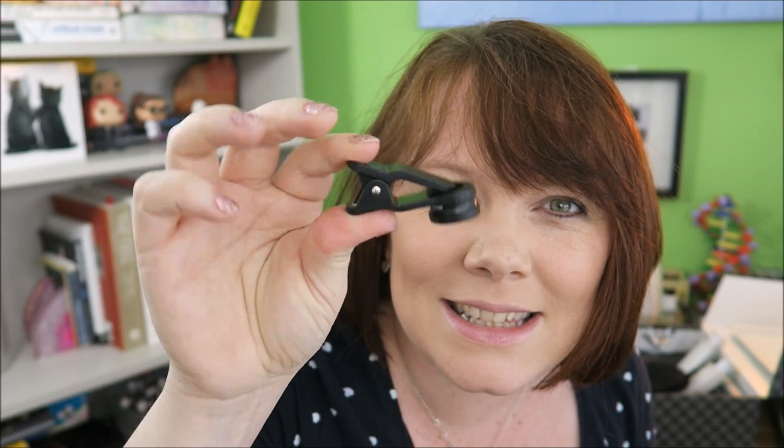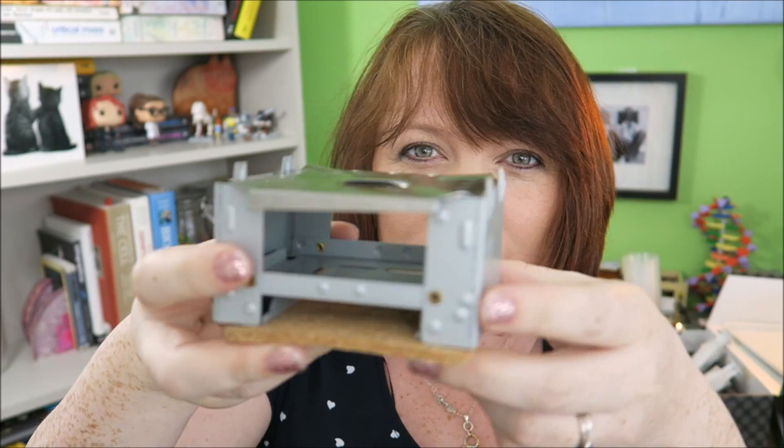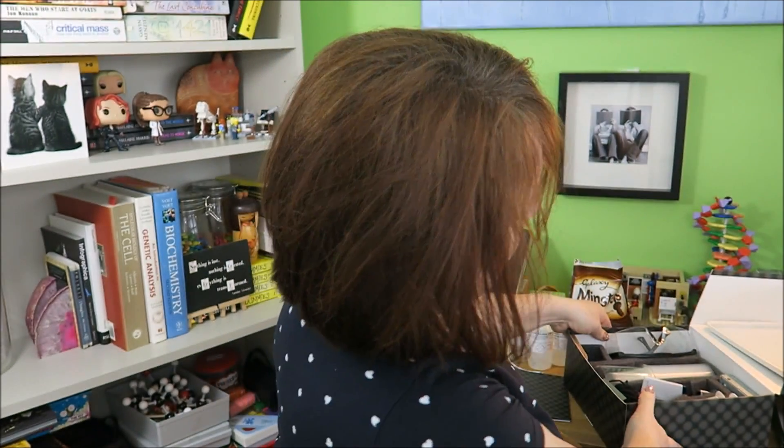Now I do. Some big syringes. This is a magnifying glass for my iPhone — awesome. This is a little stove. Comes in little parts, folds away, so that you can, you know, set things on fire. So that is everything that comes in the first kit that they send you. All in there, looking nice and neat.